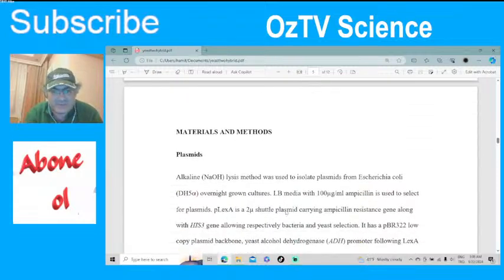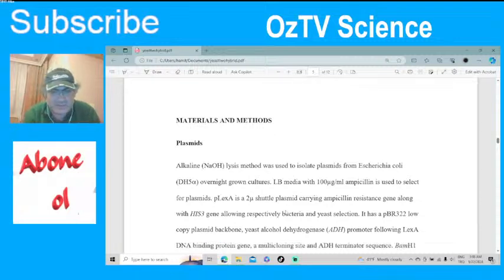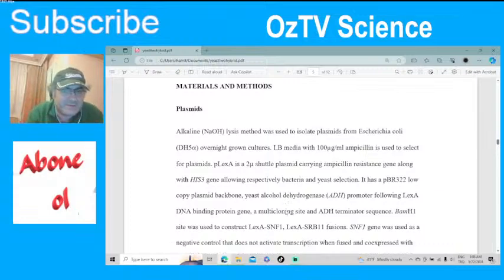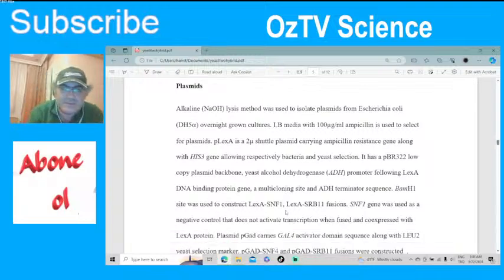So, materials and methods. Now let's understand the plasmid. I'm just going to briefly explain it. You get the plasmids from bacteria, E. coli, Escherichia coli DH5 alpha, using the alkaline lysis method from overnight grown cultures. The plasmids have ampicillin resistance genes in them, so you use LB media with ampicillin. So you select the plasmids from E. coli.